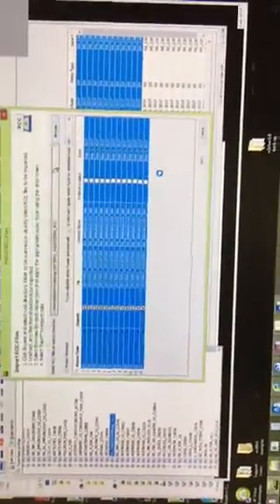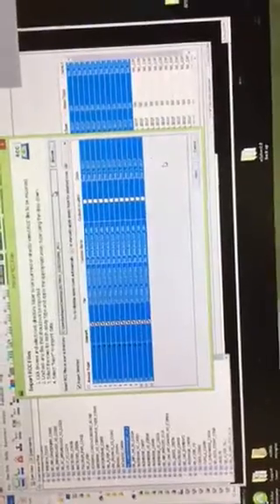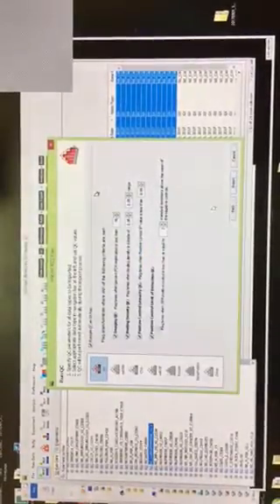Okay. So I'm going to find all the genes over here. Those are the 12 samples that I just sent to you. Yes, those are the 12 samples. And it'll look in an unzipped folder for all of the RCCs. And if there's a problem, if it's already been imported into NSolver, it'll give you an error message. But I'm just going to say next.